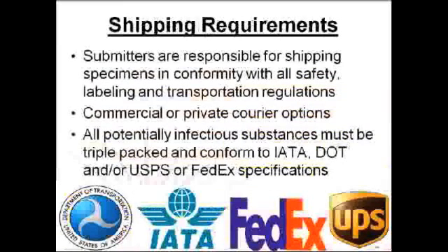Okay, for shipping samples to us, it's always the shipper's responsibility to ensure that all the regulations are conformed to, not the recipient. So there are commercial and private couriers that are available to you, and also keep in mind that anything that is potentially infectious and being shipped needs to be triple packed and conform to IATA, DOT, and/or Post Office and FedEx specifications.